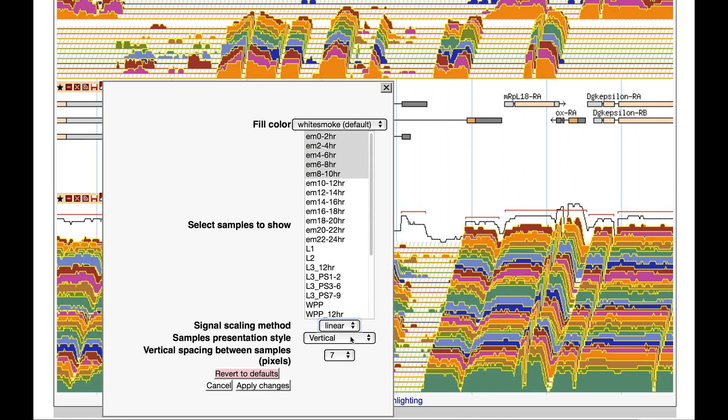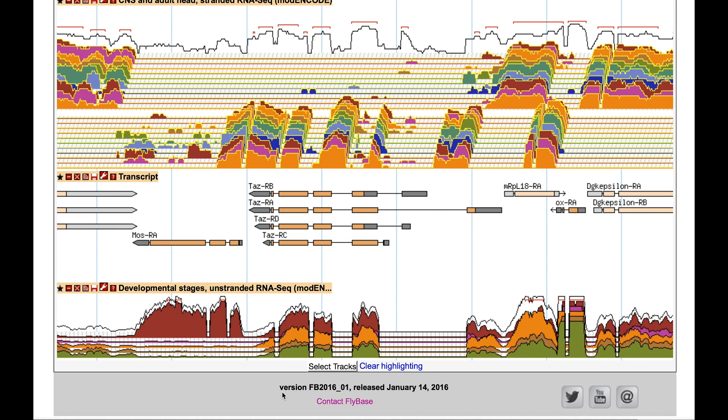If you click on Apply Changes, you can see the modifications that were made on the developmental stages tier. This tier now just shows the five selected tracks which are vertical with no offset and a linear scale.